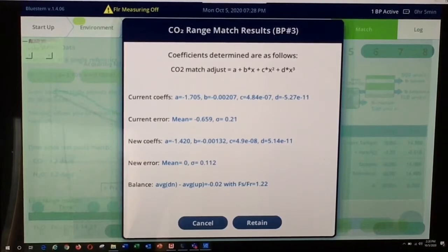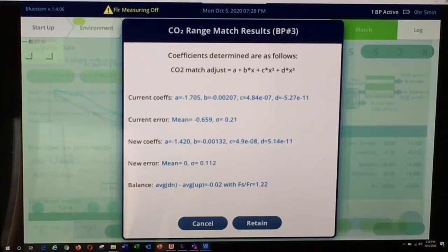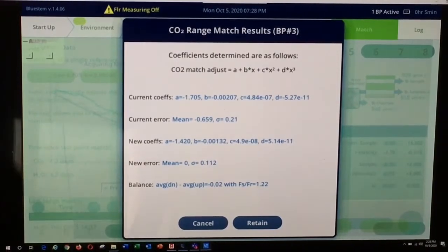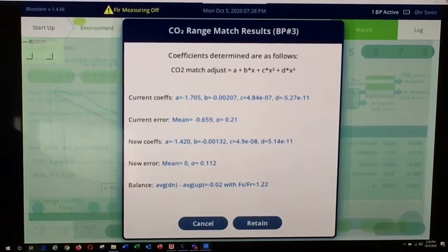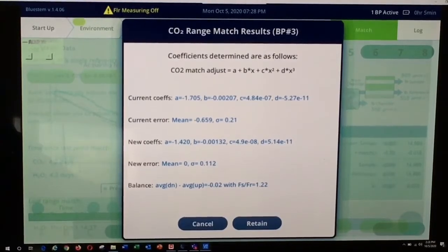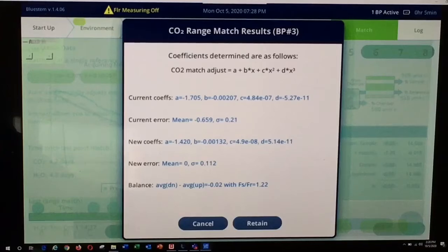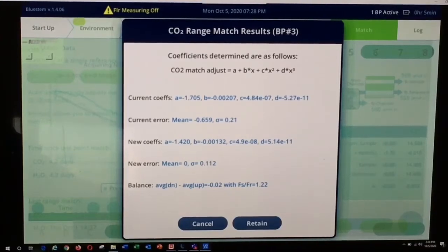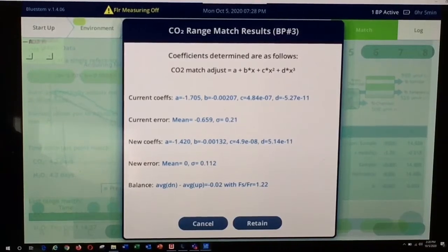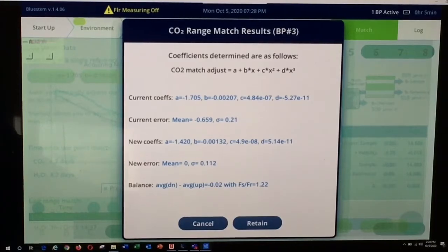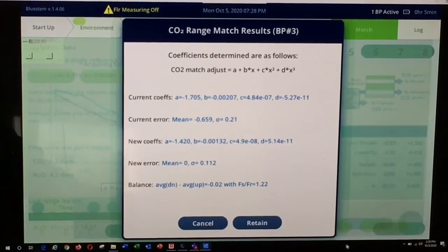In this example, the balance was negative 0.02. Any value around 0.1 or lower is fine. You will then be presented with the option of canceling or retaining. If you do not feel that the range match was well conducted, you can cancel and run a new one. In this case, the range match was satisfactorily run and I would select the retain option.